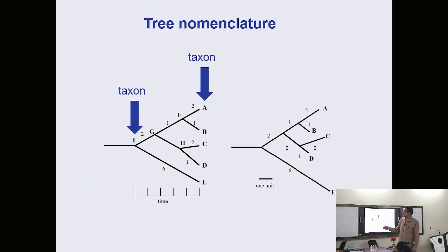They are represented by leaf nodes or terminal nodes, and at the terminal nodes you have A, B, C, D, E, and these are the sequences that you would want to begin with to understand their relationships, okay. And then the ancestral nodes are inferred. So ancestors are inferred, and as you construct the tree, you go to the last common ancestor, which is the root, okay.